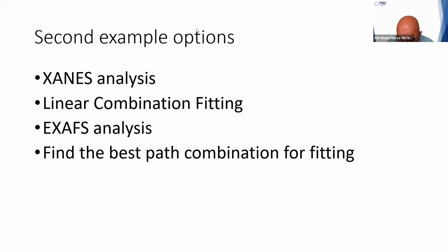Amorphous materials. The short answer is, I'm really not an expert on EXAFS processing. I'm more an expert on data management and programming. If you can deal with amorphous materials in Demeter and Athena, then it's just a matter of looking at the documentation and replicating the experiment. We can do it.